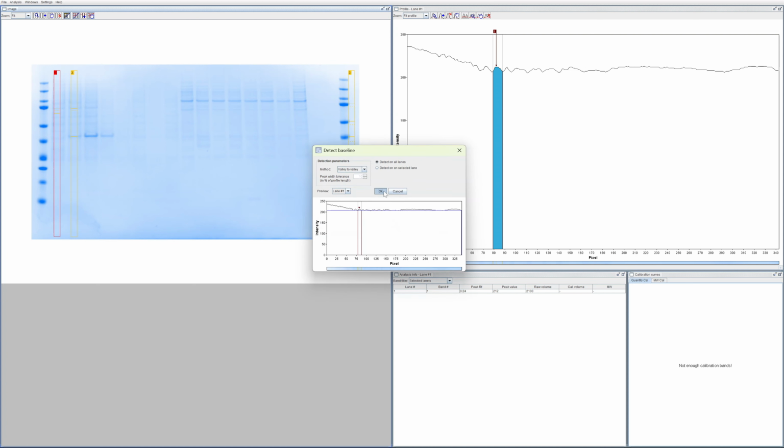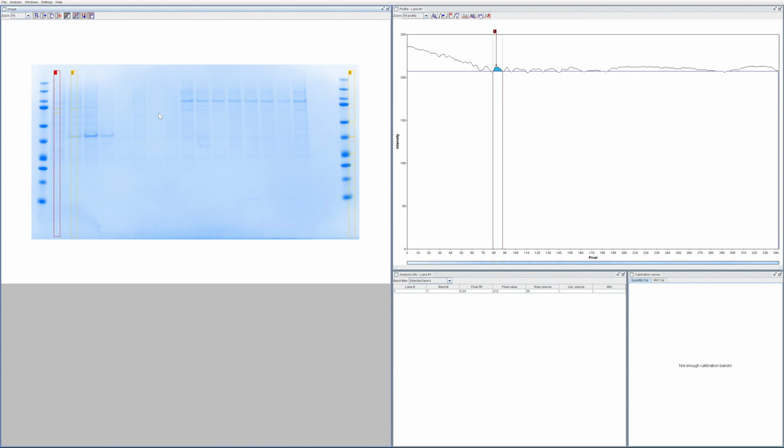It's probably not going to work because I've not given it great advice there, but what I wanted to check is if any of my tools changed to facilitate this different channel workflow. So from what I can tell, nothing's changed. So there doesn't seem to be any way of viewing the different channels of data that I know are in this image.